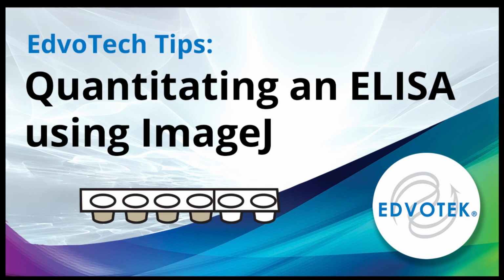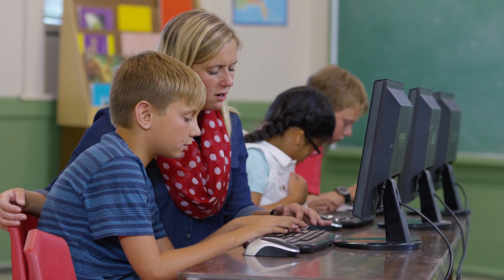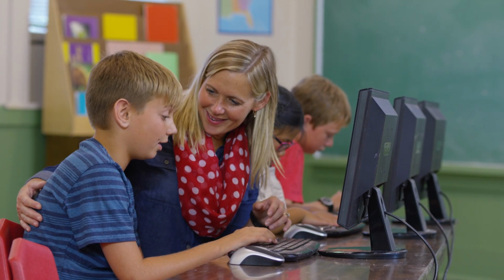EdvoTech Tips: Quantifying an ELISA using ImageJ. In this video, we'll show you how to use technology to quantify the results of the enzyme-linked immunosorbent assay with just a cell phone and a computer.